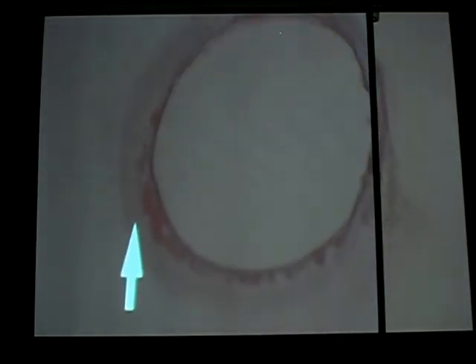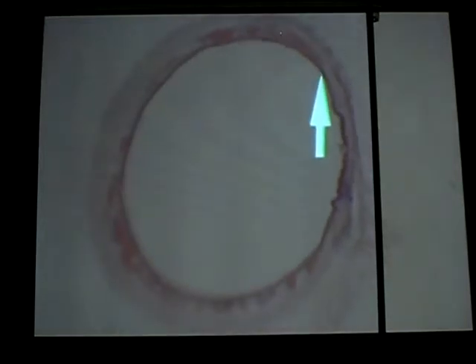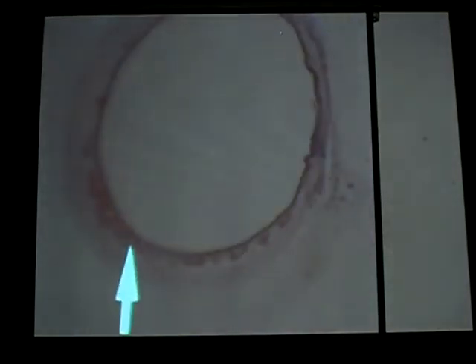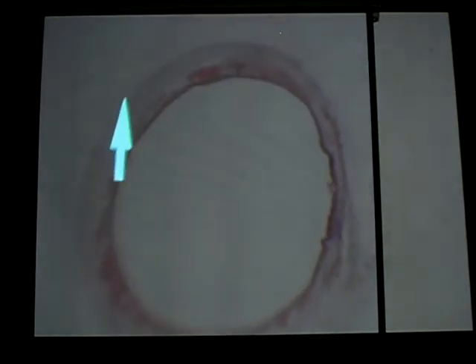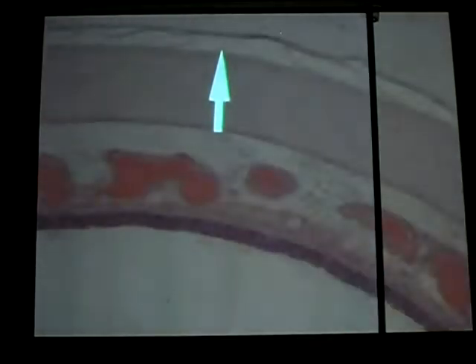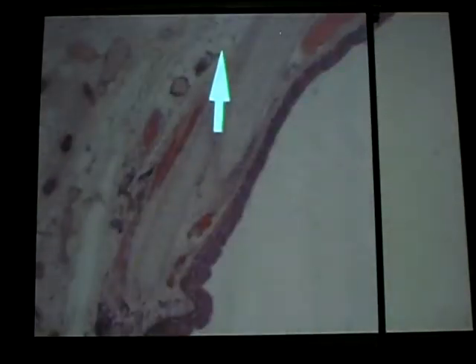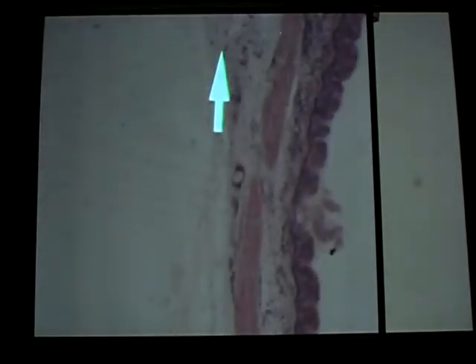We have one here that's going all the way around, and some there, and you have another piece that comes all the way around here. You have these large rings of hyaline cartilage surrounding the trachea. If you follow it, it pretty much goes all the way around. And here where the two ends meet, you're going to have a little bit of smooth muscle at that end.